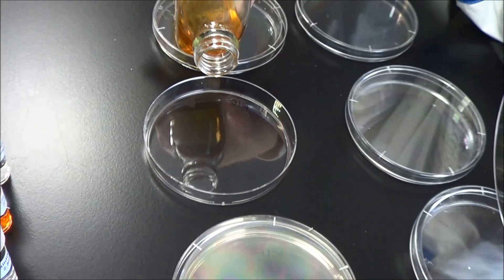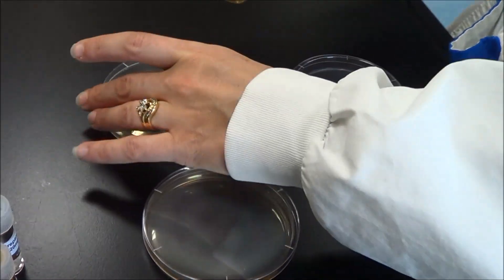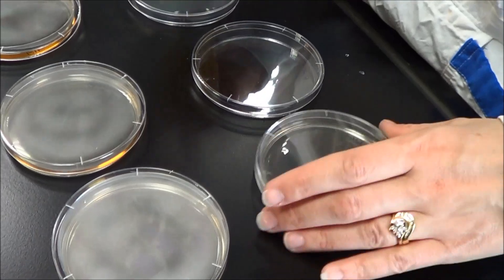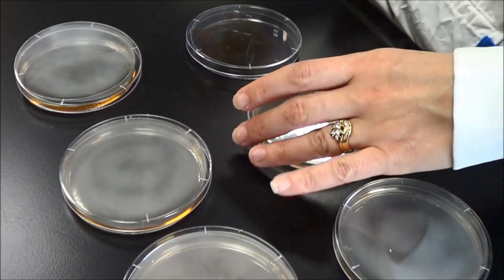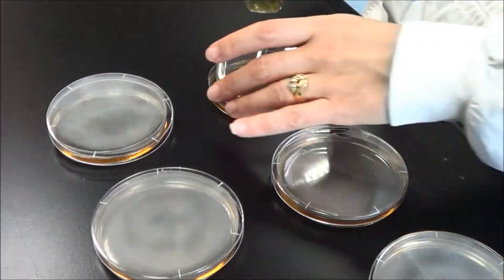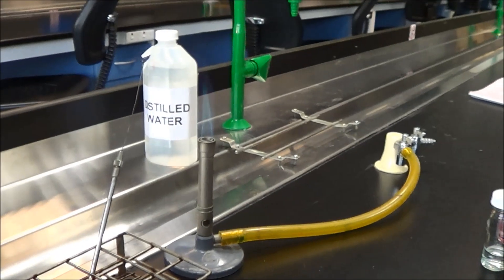Pour the agar into the labelled plates so that each plate receives about 16 ml. Work quickly as the agar will start to set in the bottle. Repeat the same procedure again for the antibiotics streptomycin and nalidixic acid.